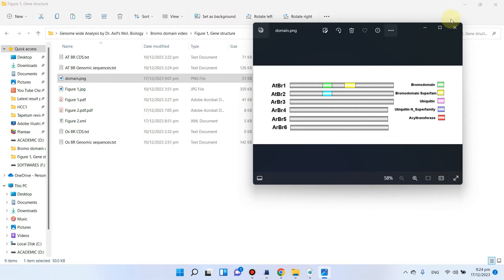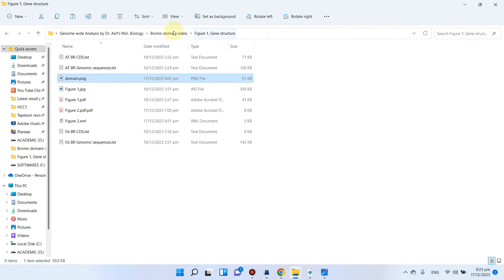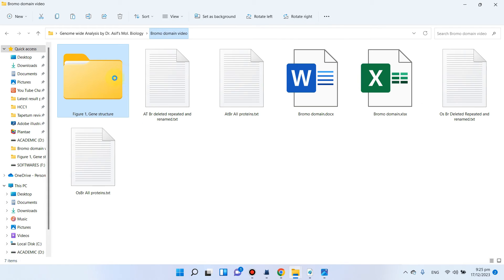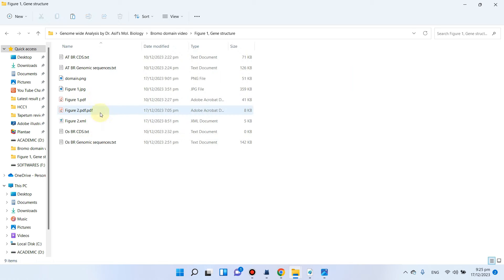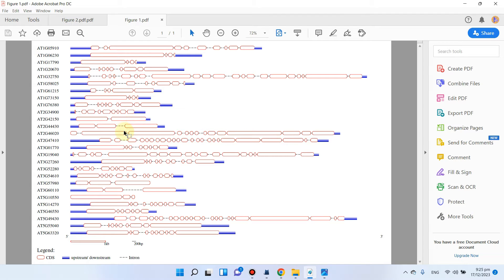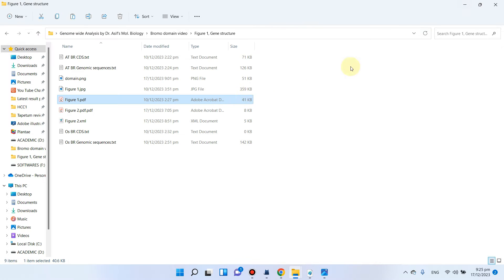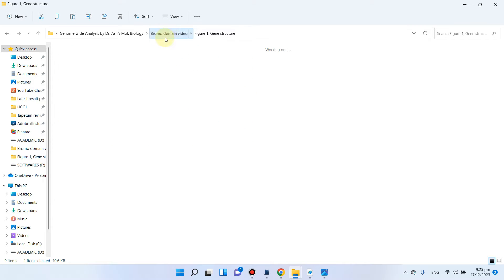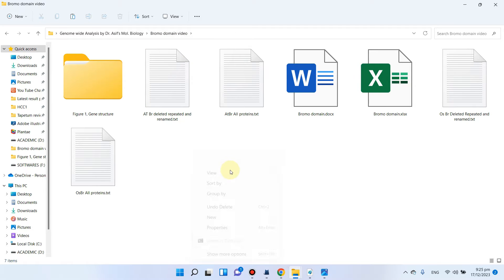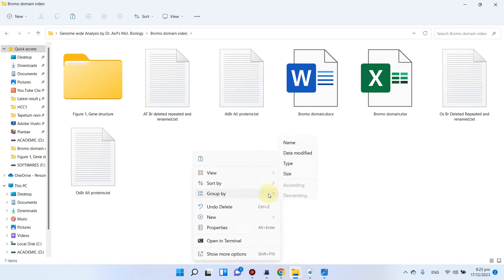In our previous video we already created the gene structure analysis. Now we will be moving toward domain architecture analysis, so let me create one additional folder for this.